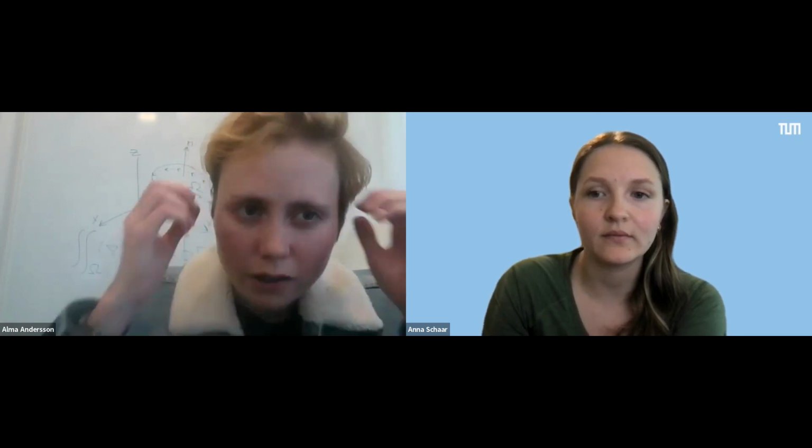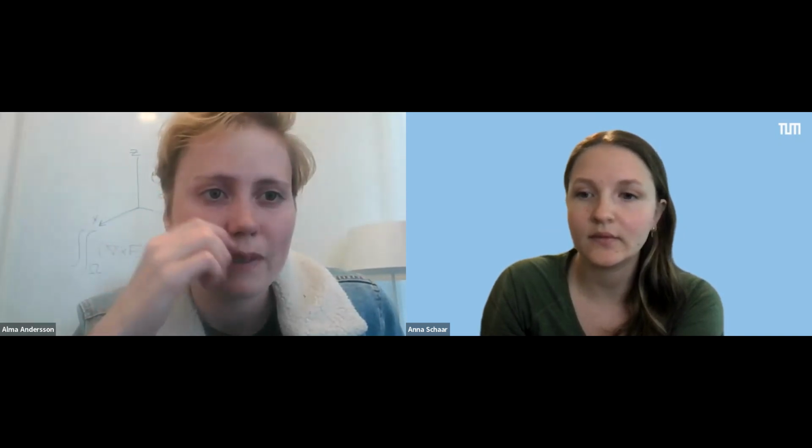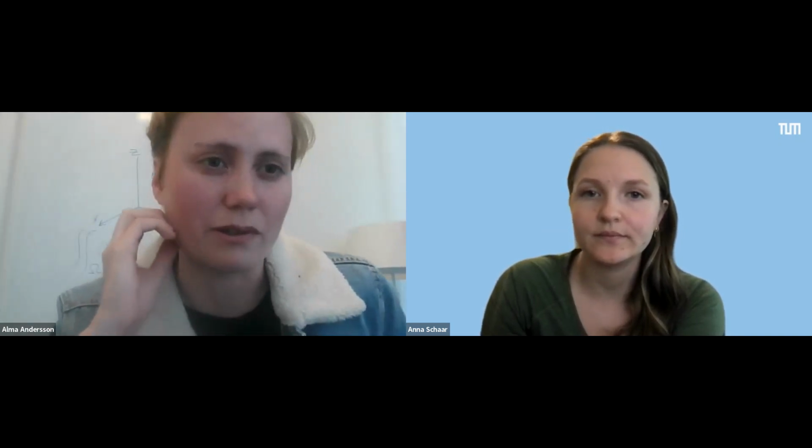Yeah, definitely. And maybe the last one before we jump into the tutorial: how do you transfer based on gene expression if there are huge differences between samples caused by pathology? For example, in sample 1, the expression of that gene is very high, while in another sample it's low or non-expressed. Yeah, so that's a good question. Let's see if I interpret it correctly. It's not really about transferring lowly and highly expressed genes, it's about using the gene expression to identify your landmarks or not. I can answer this from both angles, so maybe we get at least one answer correct.